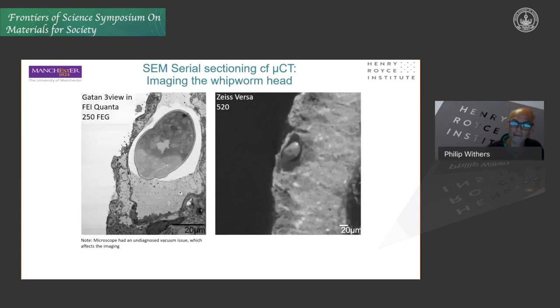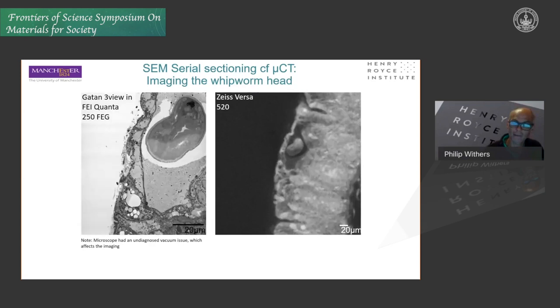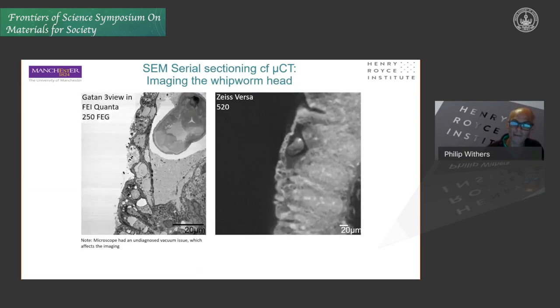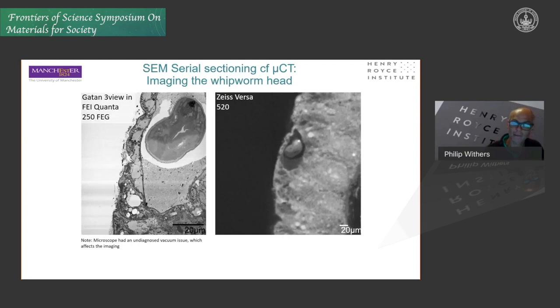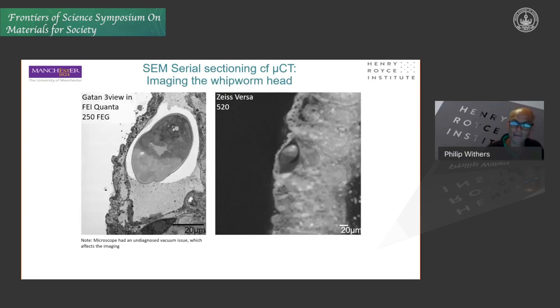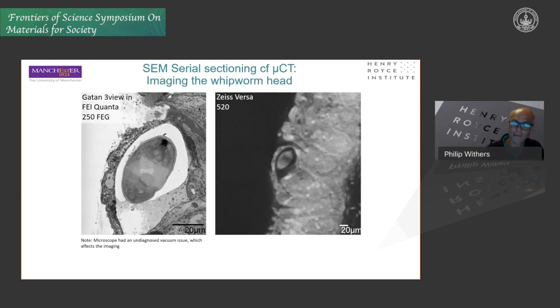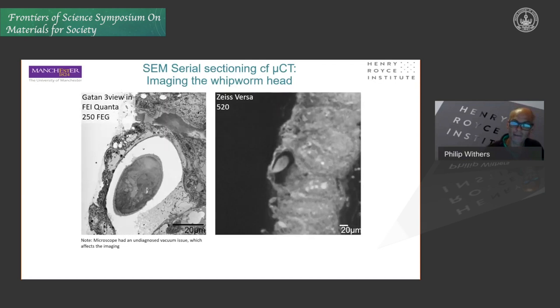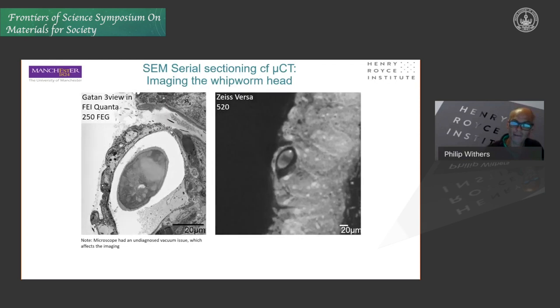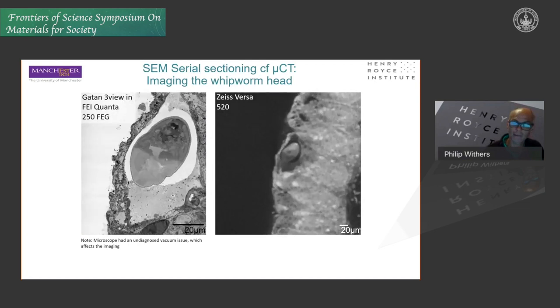Now, this is really important if we want to develop strategies to treat whipworm, because clearly we need to have strategies where treatments will be able to reach those whipworm that are buried beneath the surface. So we need to understand their life cycle. We need to understand how they submerge themselves and to find appropriate strategies to treat them. But this could easily be a defect in an additively manufactured component, or it could be a site of concern in an electronic component. The techniques are important across a very wide range of advanced materials.